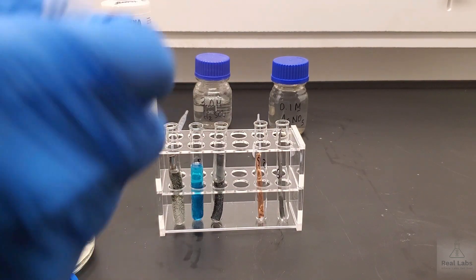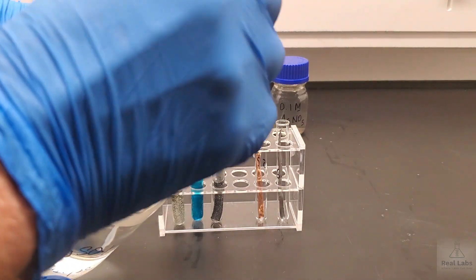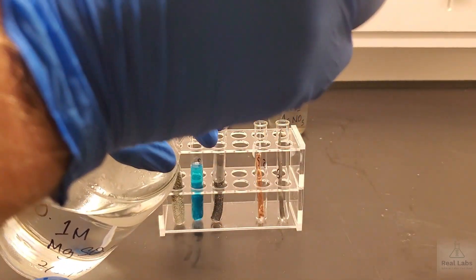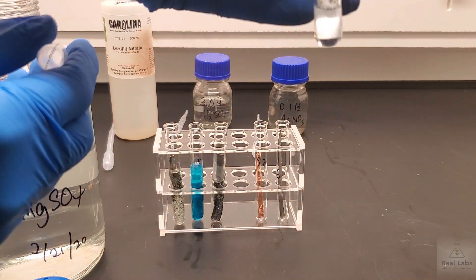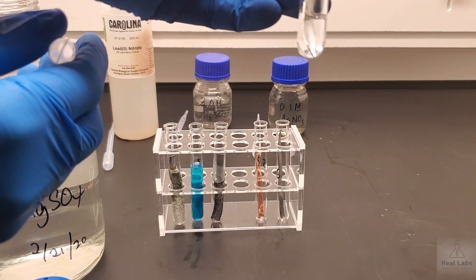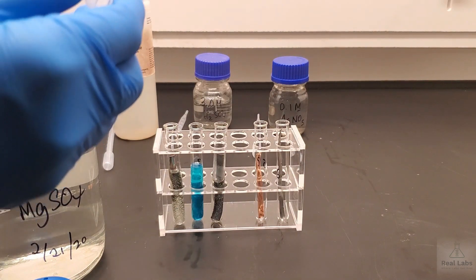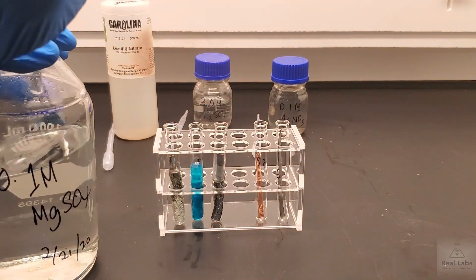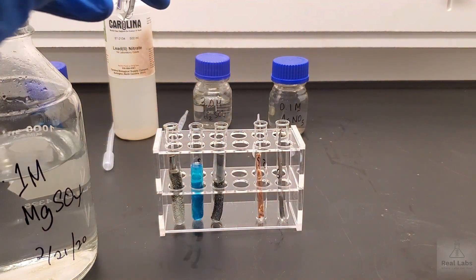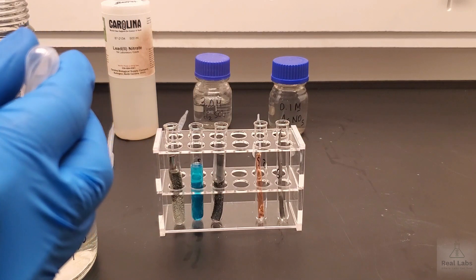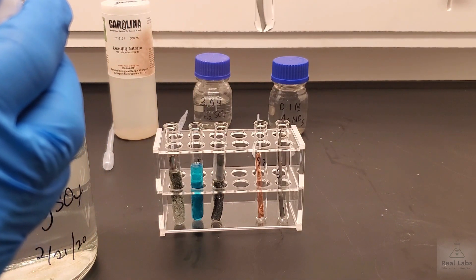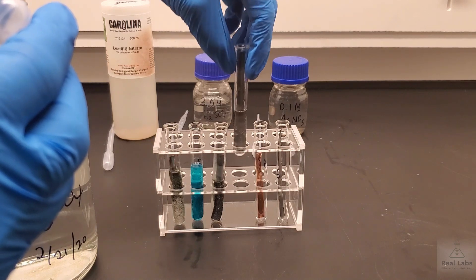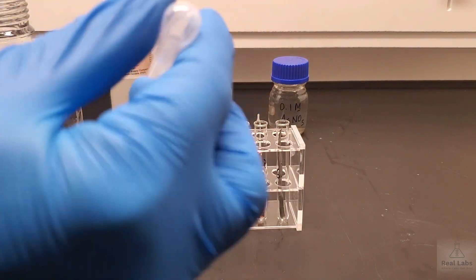We have the zinc strip in here. We're going to add some magnesium sulfate to this and see if anything happens. We'll just put a little bit in there at first. See if we can see anything happening. Then we'll take a look. First glance doesn't look to be particularly reactive. We'll let that go for a little bit.